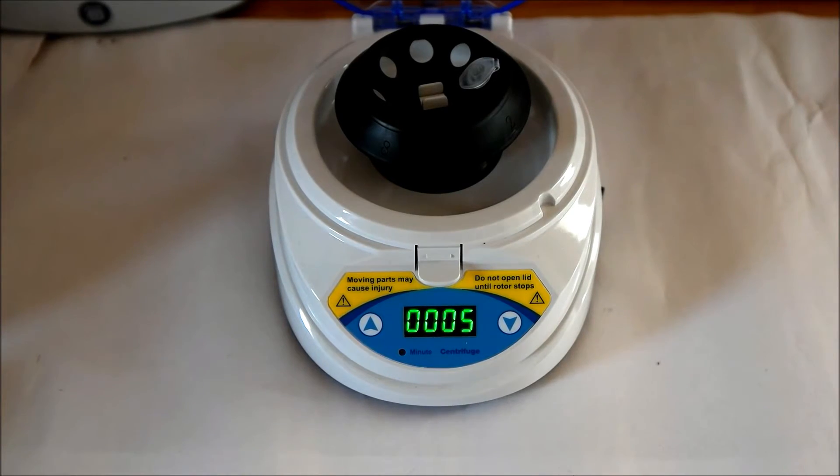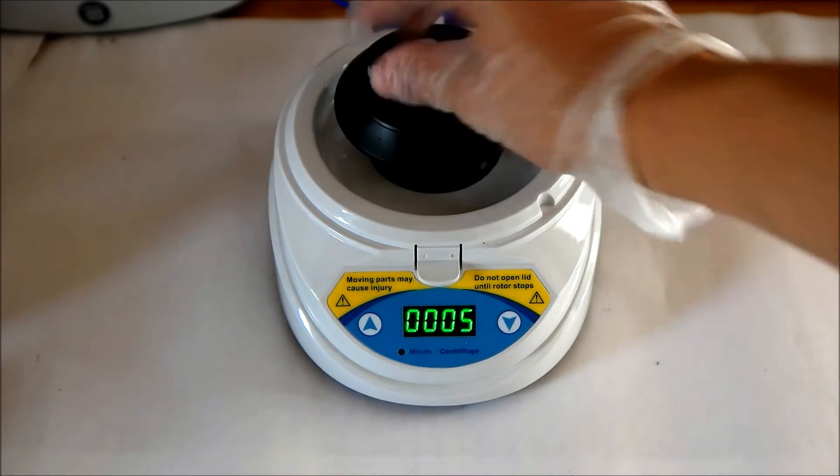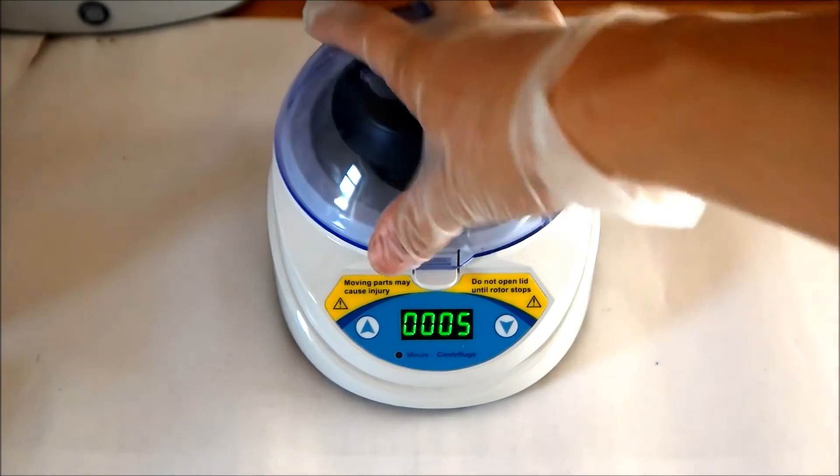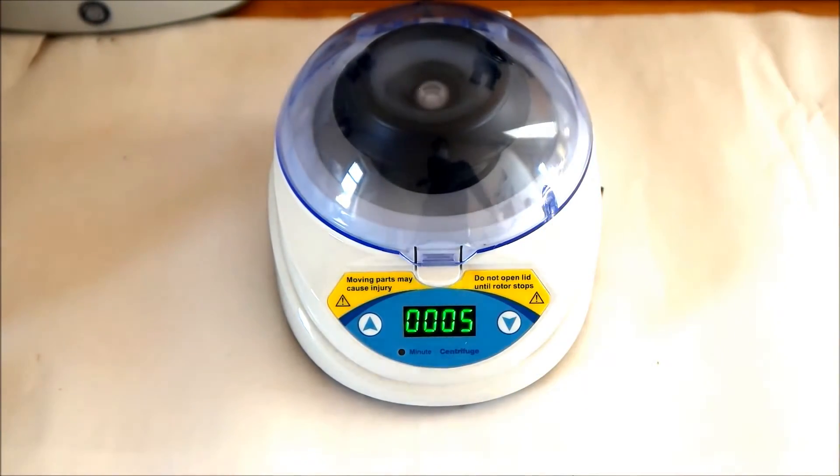Now this step is not absolutely necessary, but if you want, you can put your solution with the bacteria in a centrifuge, and centrifuge it for around 5 seconds at 6000 rpm.